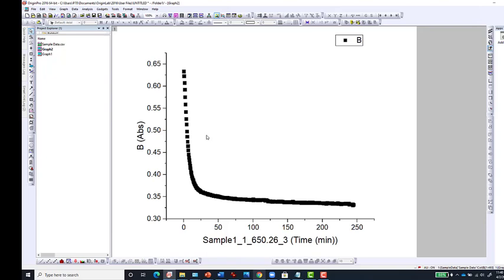So it's like when you perform an experiment, for example, maybe you are scanning. So the instrument is taking data points. It's scanning at a particular rate, maybe 1 scan per minute, or maybe 30 scans per minute. So each scan is what you see as this data point.